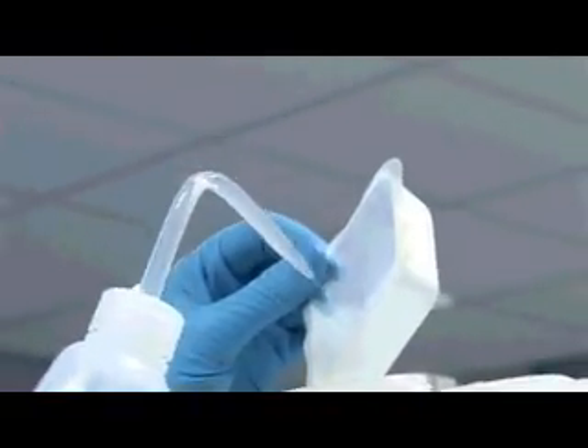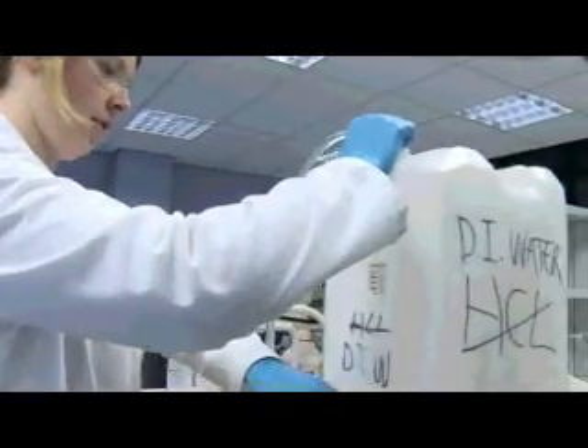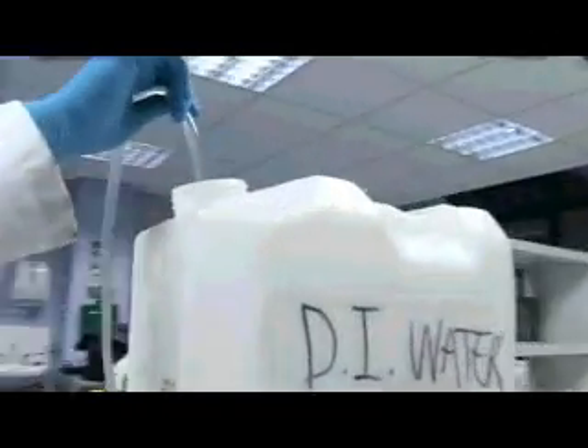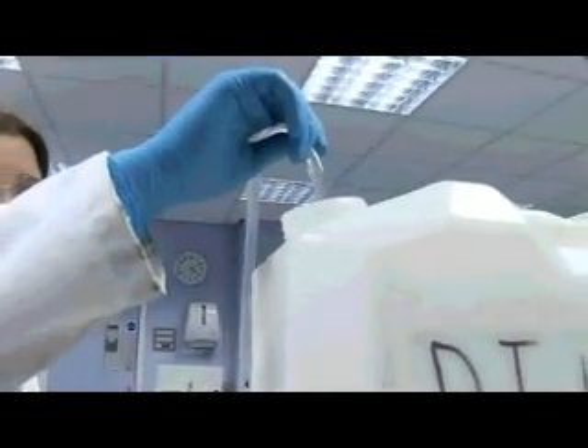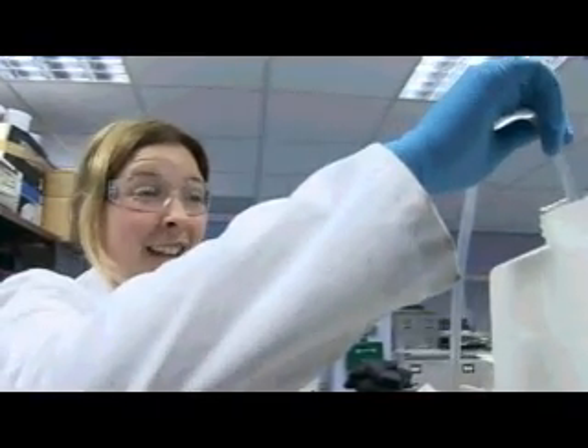I'm rinsing out any leftover nitrate that might be in the little pot. It's deionized water — it's tap water that's been treated to remove all dissolved particles and chemicals in it, so it's about as clear and as pure as water can get.